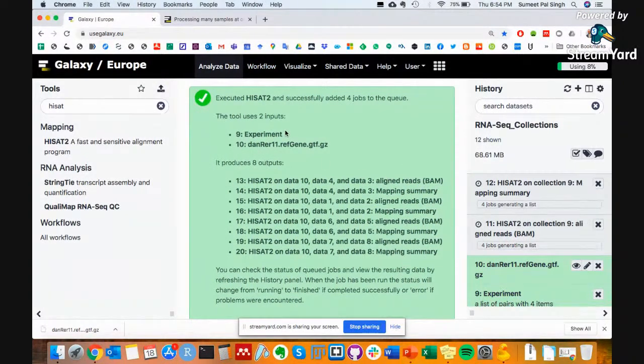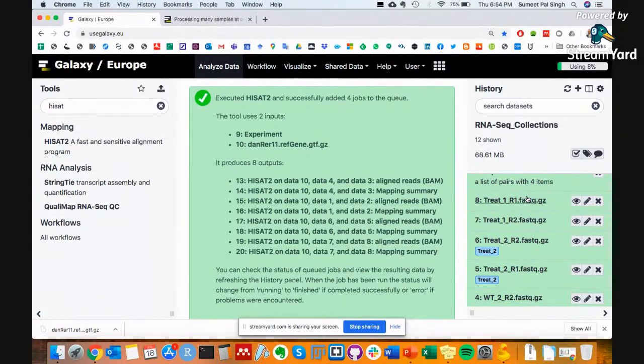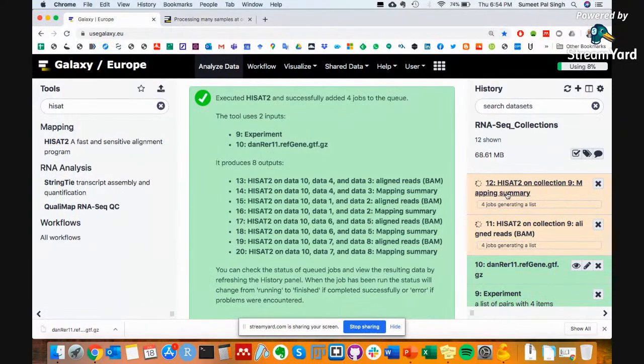So with this, you see that we did not have to run this 4 times. We just made an input collection and we ran it once, and it would make all the 4 together. Not only will it make all the 4 together, but it's also going to package them as one item. Because of this kind of packaging, you get your data together. So this is pretty nice, because you are not running the same thing again and again and again. It's much more automated, right?